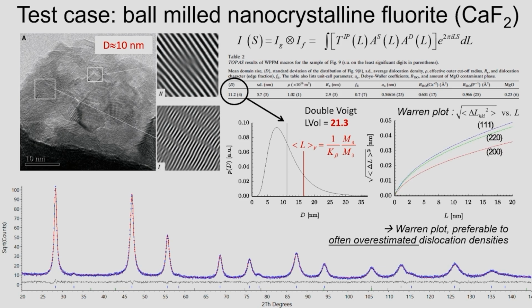And then, if you like, the Warren plot, I said, this tells us something about the anisotropy, even on a qualitative level. It means you see more displacement along 111 than along 200. In fact, if you take fluorides and many binary compounds, salts, oxides, this is a common feature that the direction which is soft is along the body diagonal of the cube, so the 111 direction, whereas the stiff one is perpendicular to the cube face, which is completely the other way around than cubic metals. Opposite behavior. And you can see it immediately.